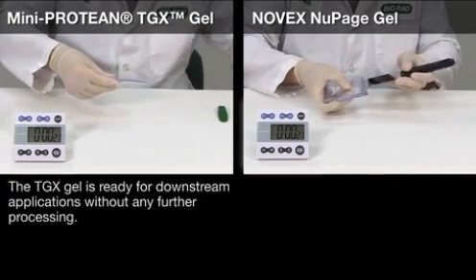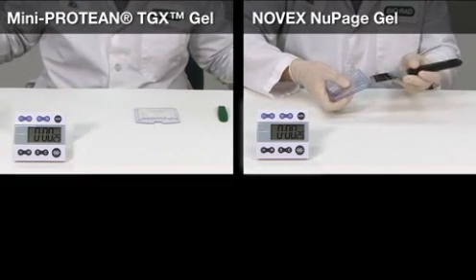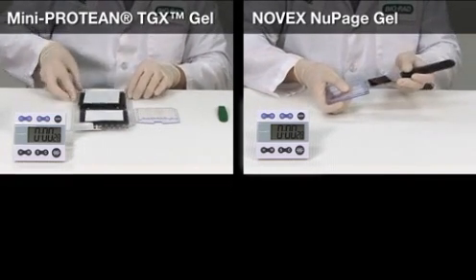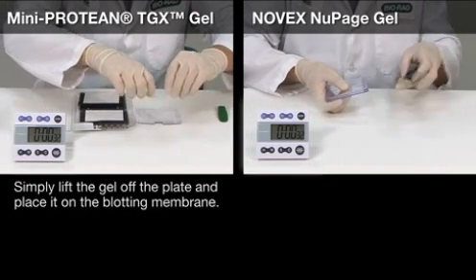The TGX gel is ready for downstream applications without any further processing. Simply lift the gel off the plate and place it on the blotting membrane.